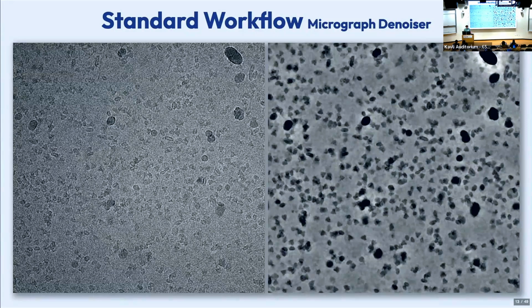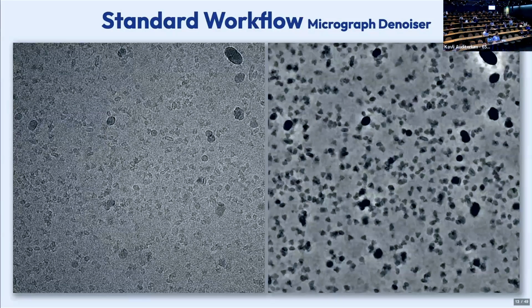I'll talk about this topic a little later today as well, about how the denoiser works and why we think it's really useful for particle picking. But in our hands so far, on every challenging data set, we found that denoising and then blob picking or template picking on the denoised micrographs works really well, especially for avoiding empty ice regions or particles that are picked on contaminants, because not only is the contrast enhanced by the machine learning model, the grayscale level of the particles becomes a lot more consistent, and I'll talk about this later as well.